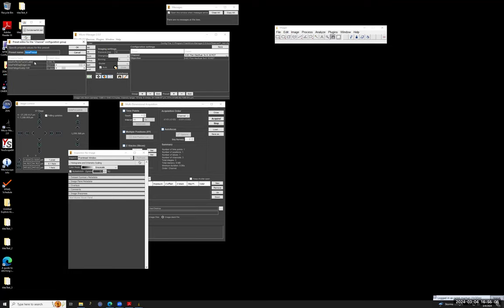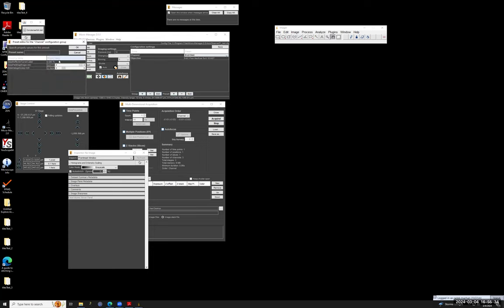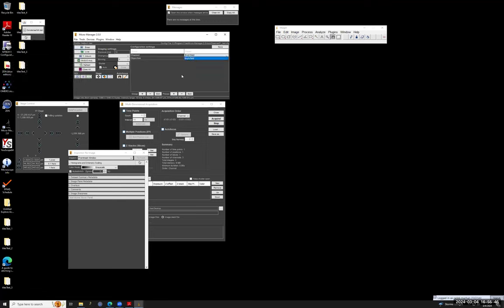And then I can create different presets and give them names. So I can create a preset bright field, which will use this DIC transmitted light filter cube. And then I can create new presets. So I can create a preset which uses DAPI filter cube and will be called DAPI, and so on. So now I have, was it created? Yes, it's there already. So in this way I could create all the presets that I want.